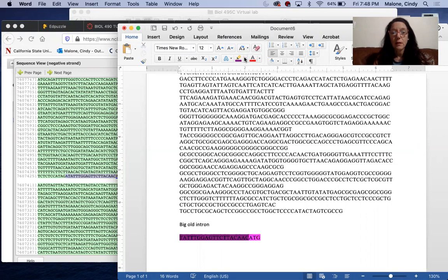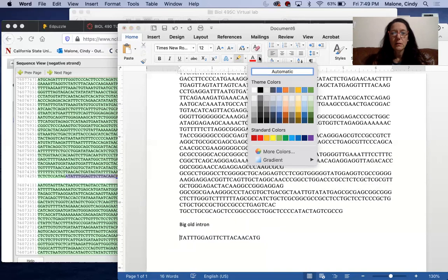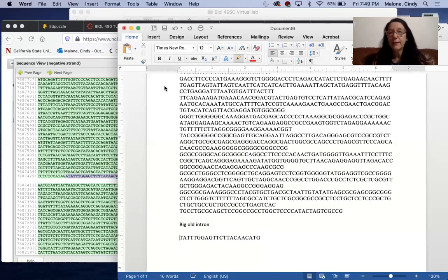No. Ah! Okay, this is dumb. What is happening? Oh, I'm just trying to highlight. Oh my gosh, people, why is that not going away? What is going on here? I think it's stuck. All right, I'm not coloring it.